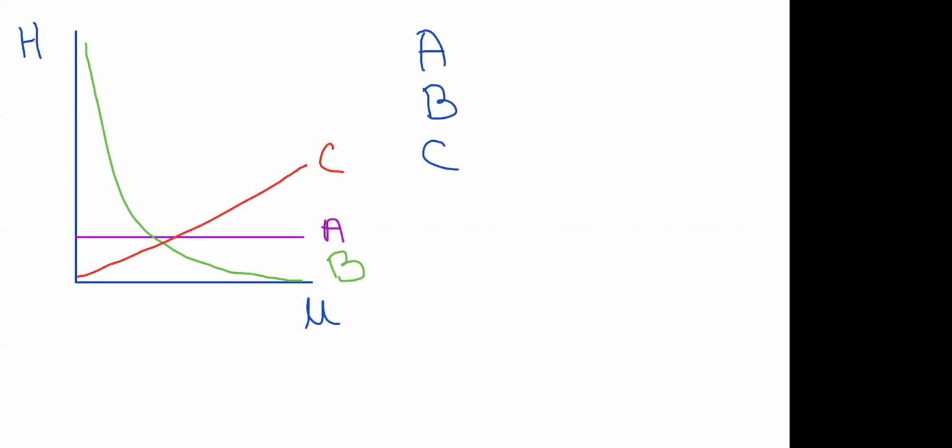This is because if our flow rate is increasing, then it becomes increasingly hard for the molecules to transfer to the border of the mobile phase and stationary phase, where the compound can transfer from one phase to another, become retained, and then come back. So the faster the mobile phase is flowing, the more impactful the resistance to mass transfer is.